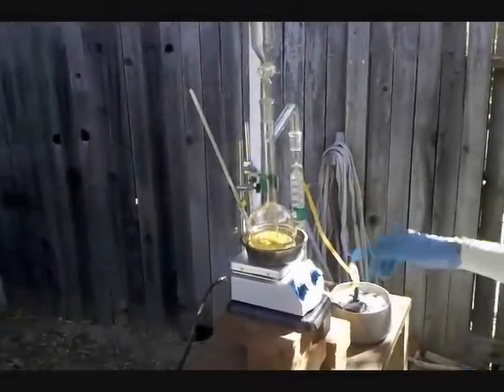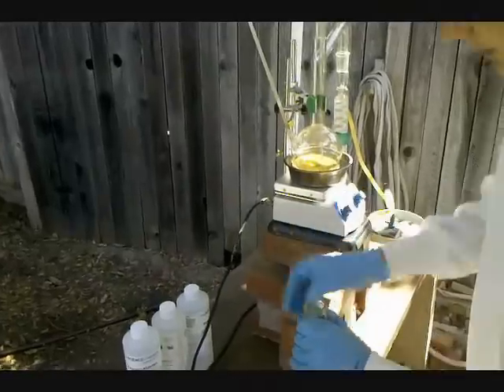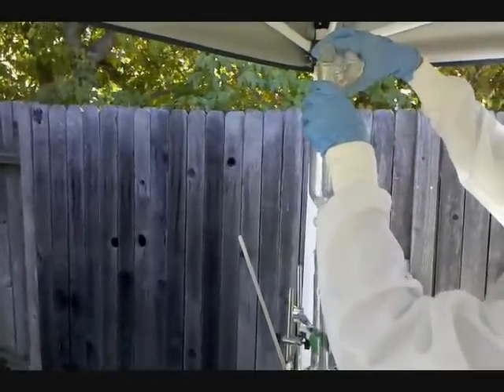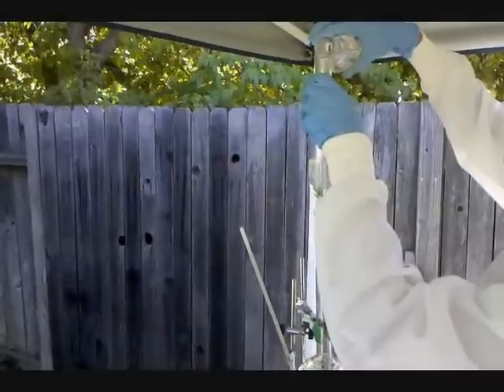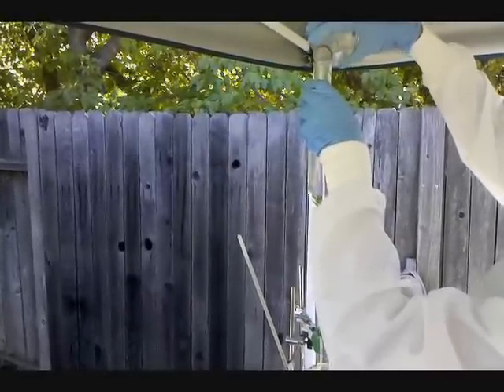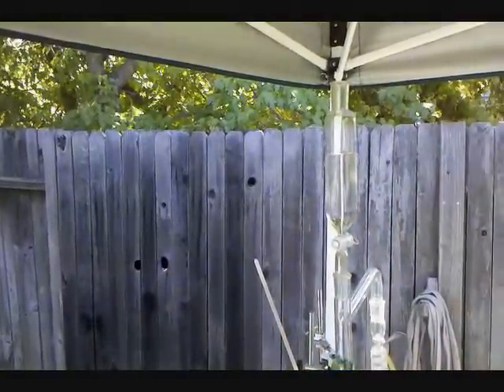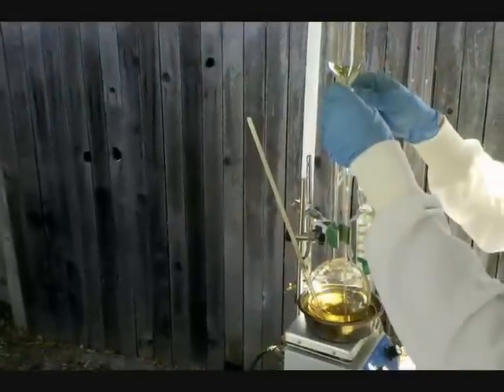The cold sulfuric acid has been added to the reaction vessel, and I'm going to be adding the cold ethanol by means of the addition funnel. Heat has not been turned on yet, so I'll turn on the heat and start to add the ethanol.